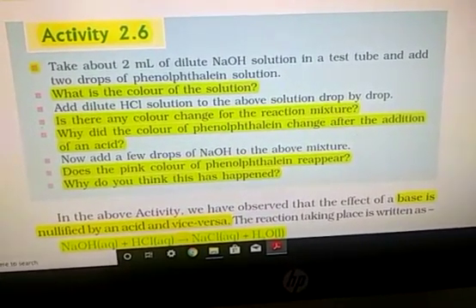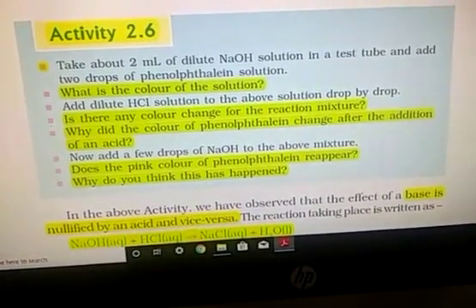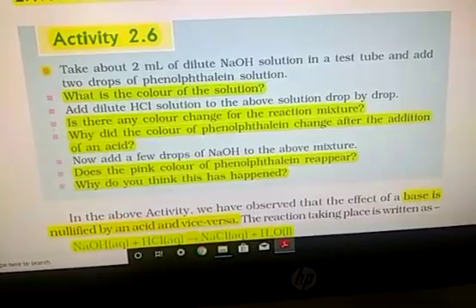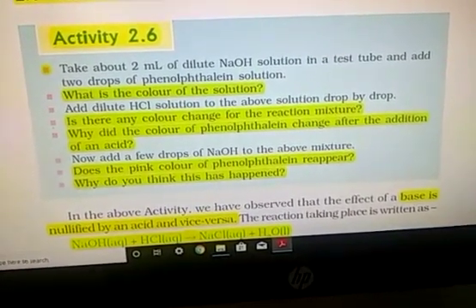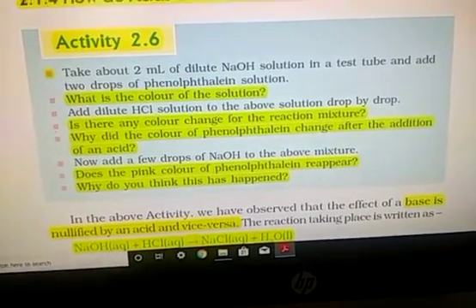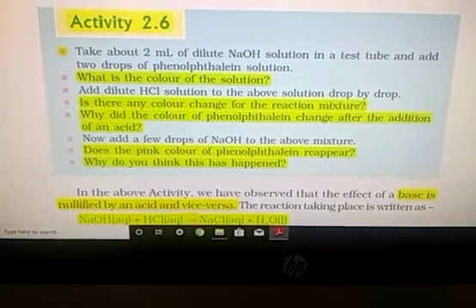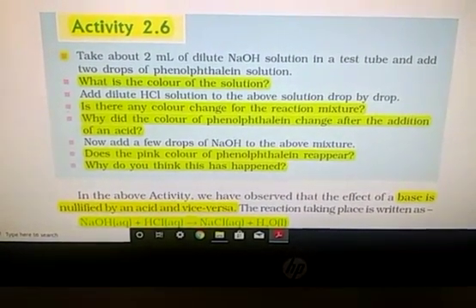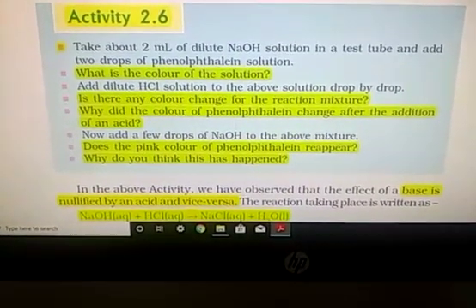Now we add few drops of sodium hydroxide solution, color reappear and our solution become basic. So if in your mixture base becomes excess, phenolphthalein gives color. If HCl becomes in excess, phenolphthalein gives no color. Why do you think this has happened? It happened due to the neutralization between sodium hydroxide and HCl.